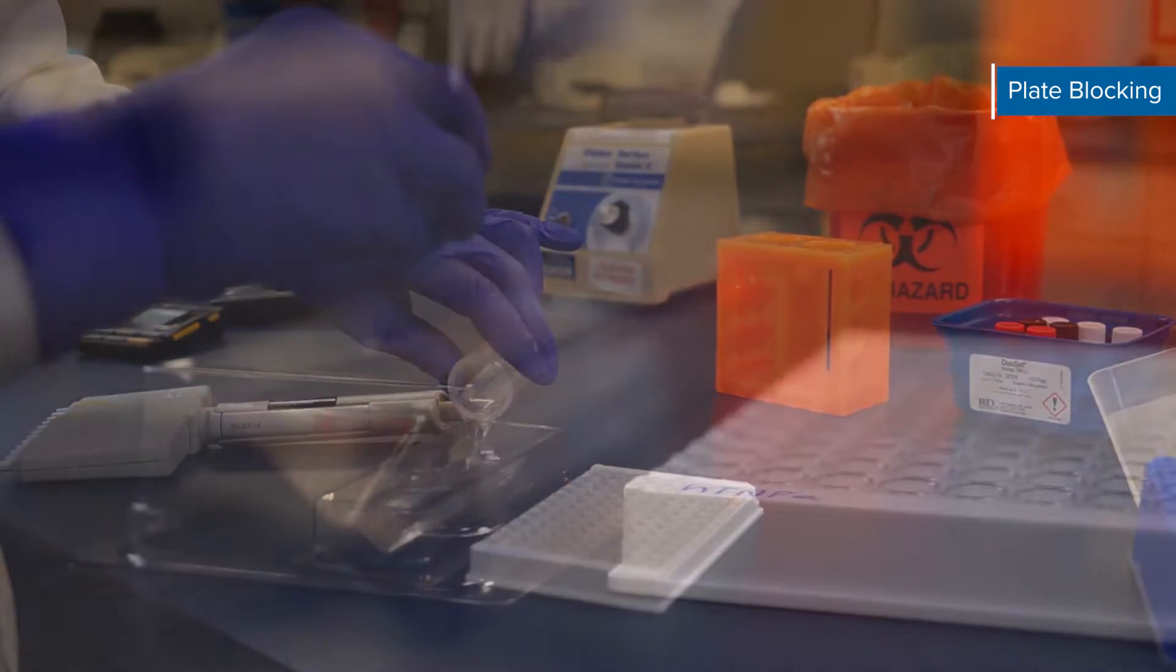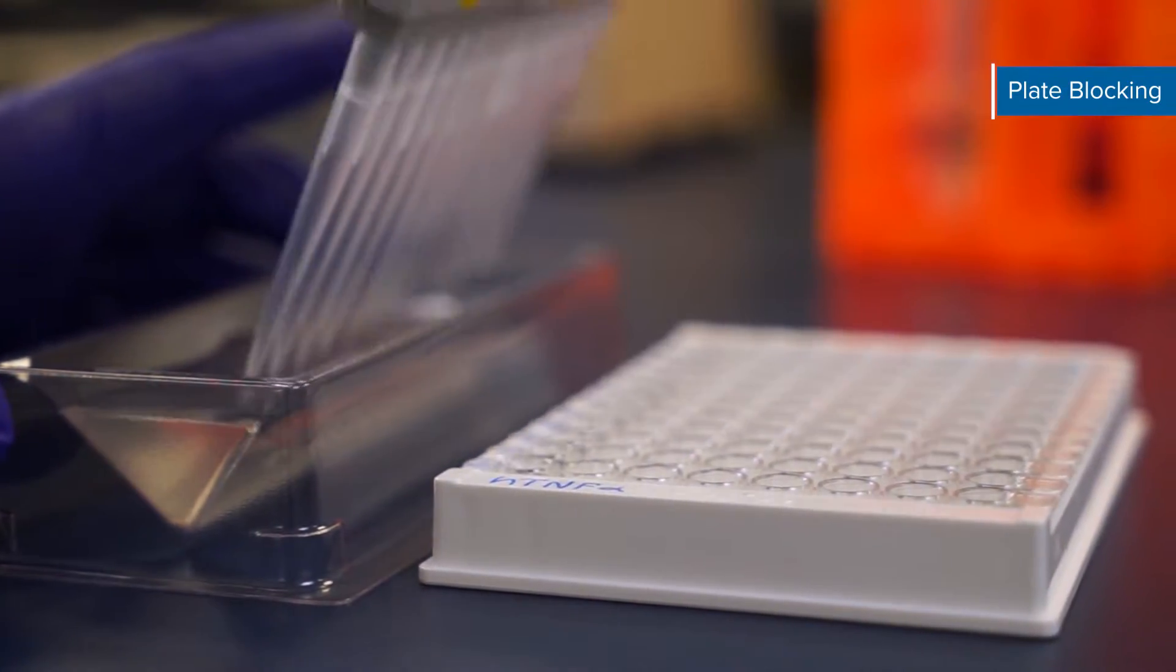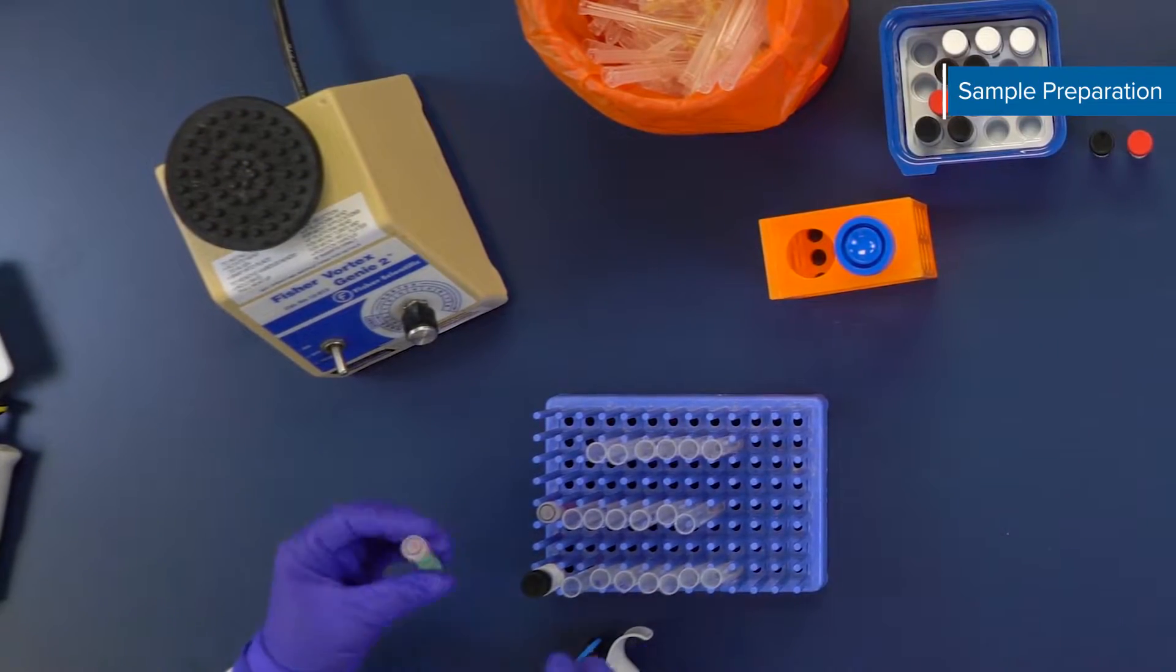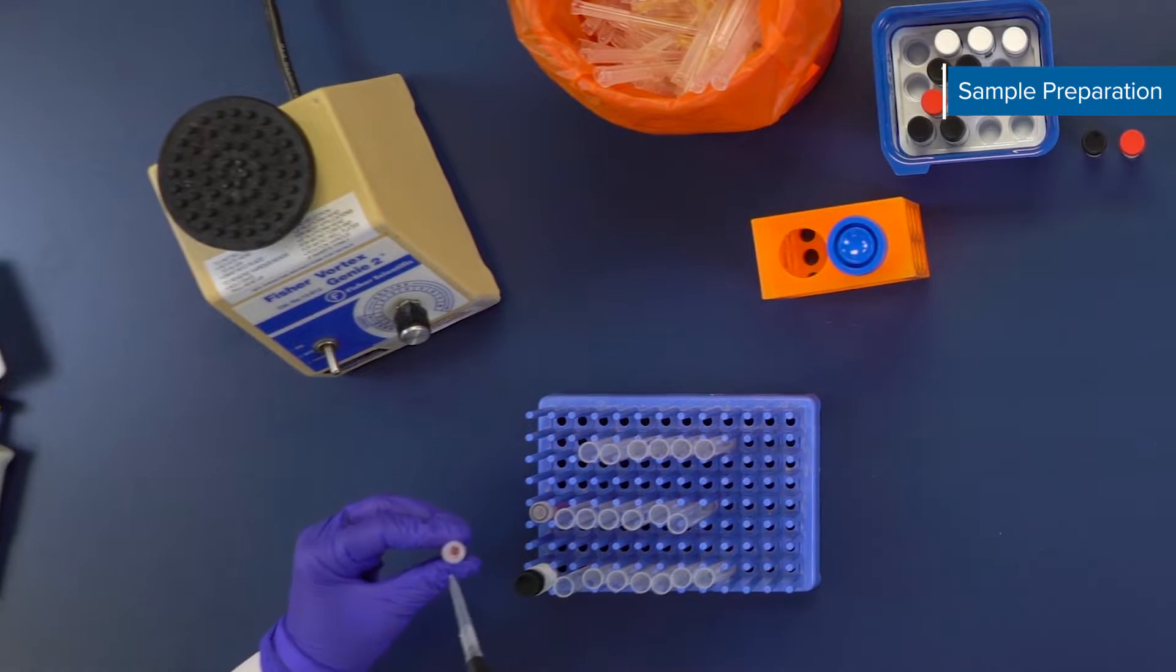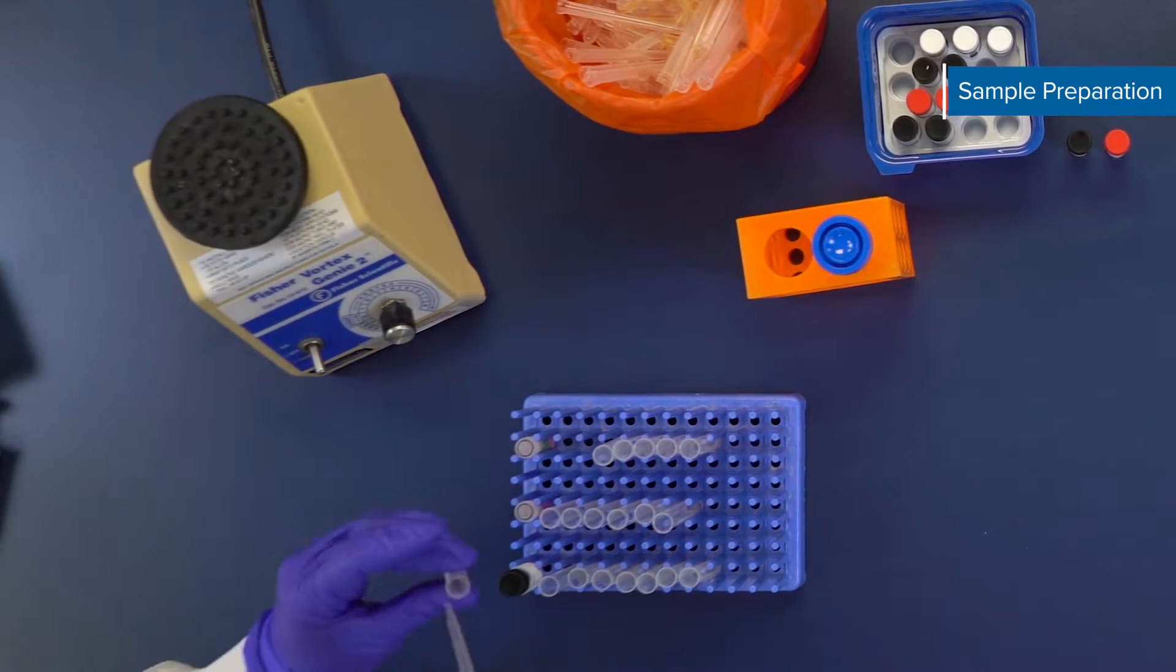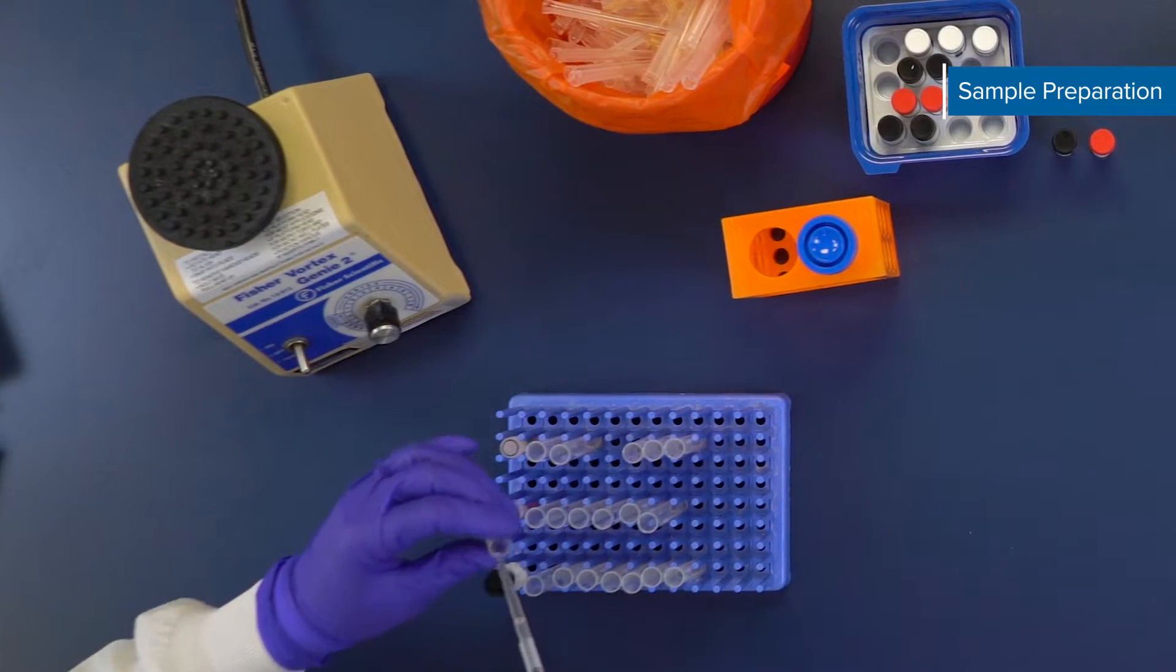Next block the coated plate by adding 300 microliters of reagent diluent to each well. Incubate at room temperature for a minimum of one hour. During this incubation prepare your samples for testing. Samples may be diluted in reagent diluent and should have volume sufficient to add 100 microliters to each well. It is recommended that all samples are assayed in duplicate.